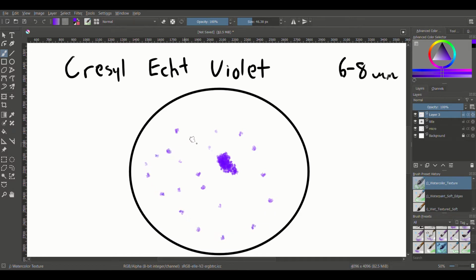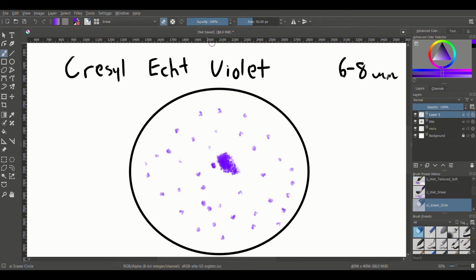Like I said, it shouldn't be terribly dense because it's neural tissue, so that's kind of good. So let's say we had just one neuron with a bunch of Nissl substance in the middle here. As you differentiate, you're also going to see a ton of background staining in general.